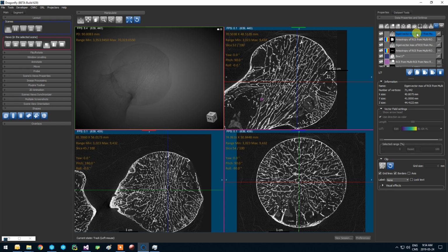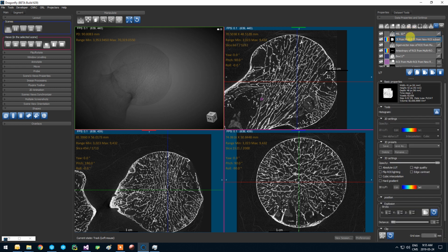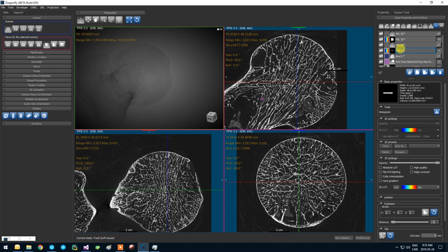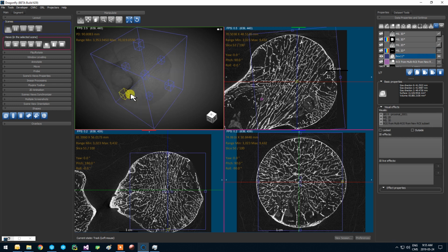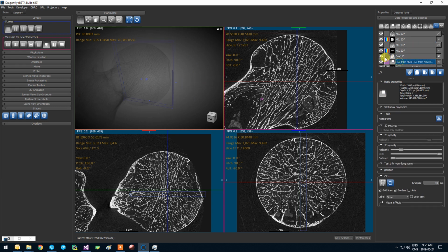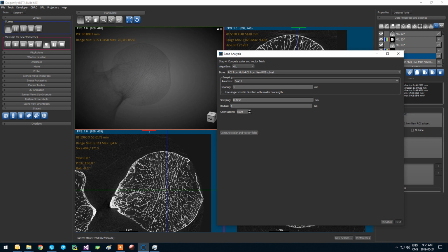Okay, so this is mil 3D, mil 3D, mil 2D, mil 2D. My box is still in 3D. I will put it a bit thinner. I'll compute the 2D mapping first to see the aspect of the result. I will hide this, bring back this, and I will go to surface normal.